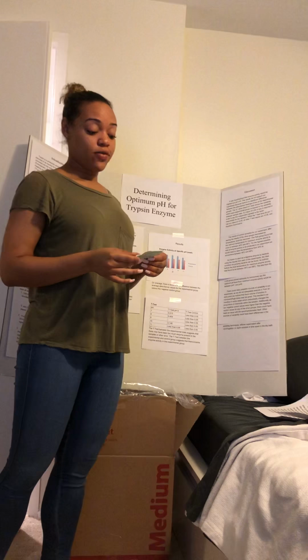After the enzyme trypsin was added to our samples, we had to start a timer for the reaction, and we decided that we would keep our samples at a constant temperature. Each of them was submerged in a dry bath for 20 minutes at 37 degrees Celsius. After they had been in the dry bath for 20 minutes, you put on gloves to handle the TCA, which was going to be added to each sample.